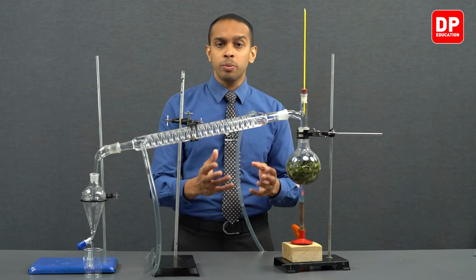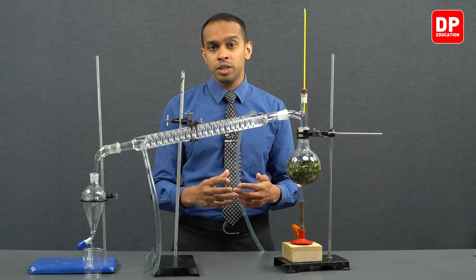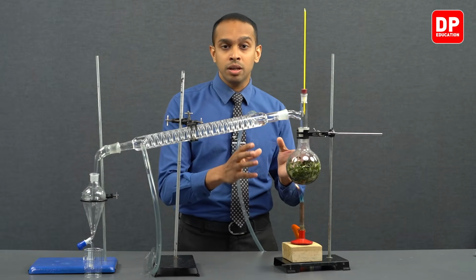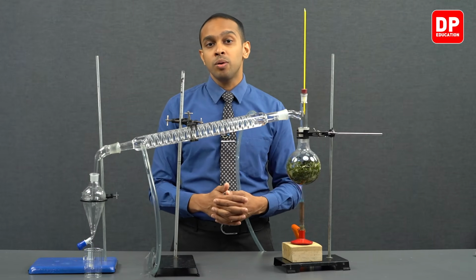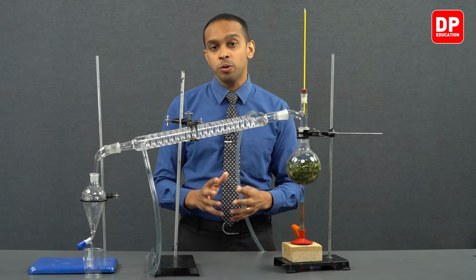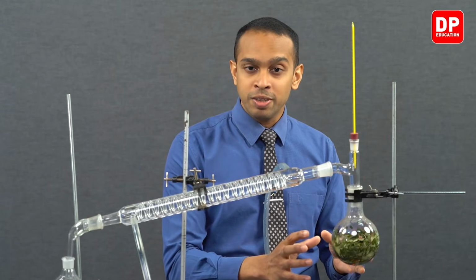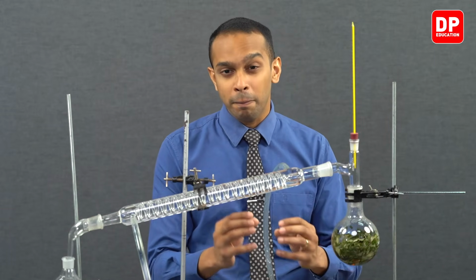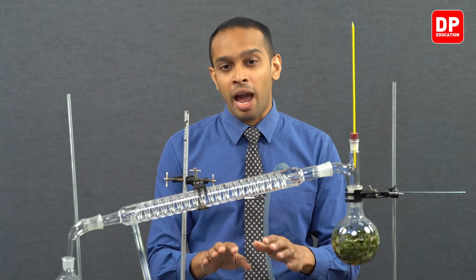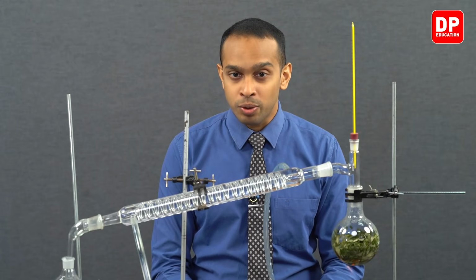So water usually boils at 100 degrees Celsius, and eugenol, which is the main essential oil found in the cinnamon leaves, has a boiling point of 254 degrees Celsius. However, when you have this oil and water mixed together, this mixture boils at a lower temperature than both of these individual components.